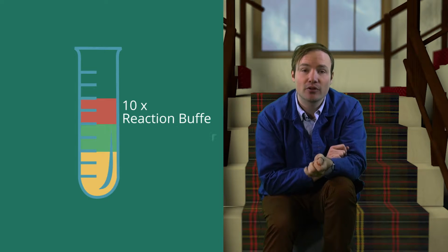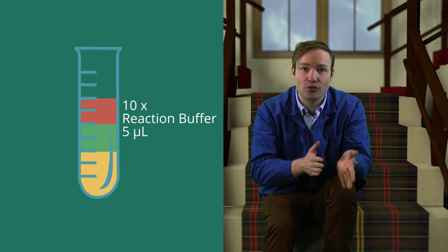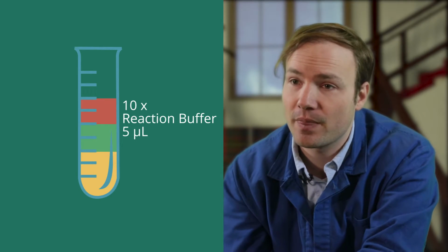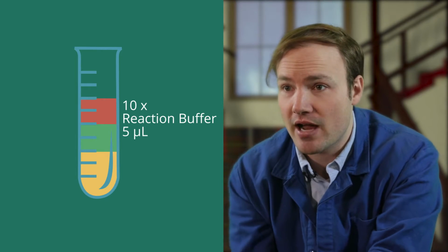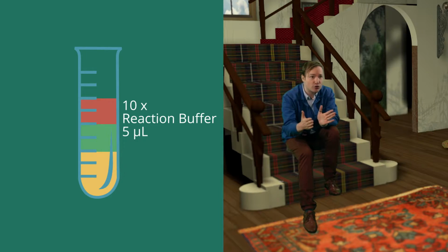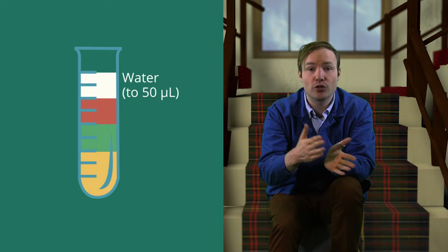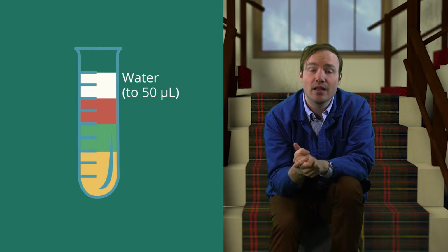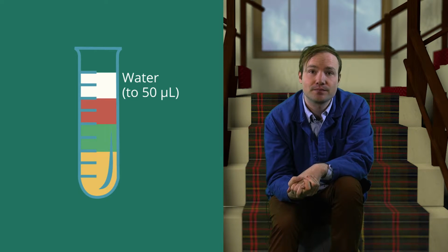The reaction buffer creates the ideal conditions for the enzyme to act. The right pH, the right magnesium concentration, and so on. Wherever you buy your enzymes, they will always come with an appropriate reaction buffer. A common mistake is to think that reaction buffers are interchangeable, but in general they're not. So don't be a maverick, follow the manufacturer's instructions. Water we add to control the total reaction volume. In this way, we can manipulate the concentration of all of the other ingredients.